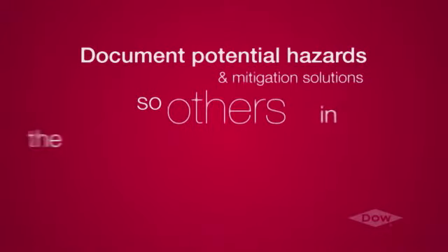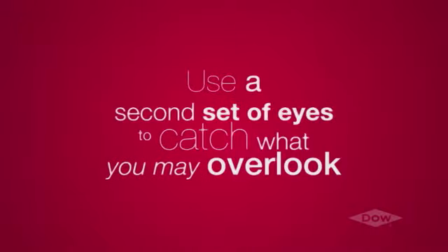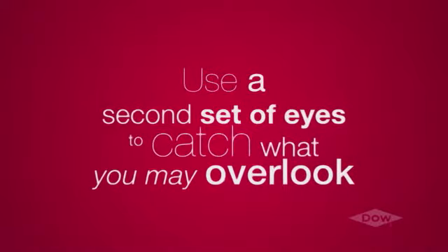Documenting potential hazards and mitigation solutions is also an important component to managing process change. This ensures that others know about your changes, their potential hazards, and their impact. The more everyone in the lab understands, the safer the lab becomes. A second set of eyes can often see what you can't. The truth is that we become so familiar with our own work, we often overlook the obvious.